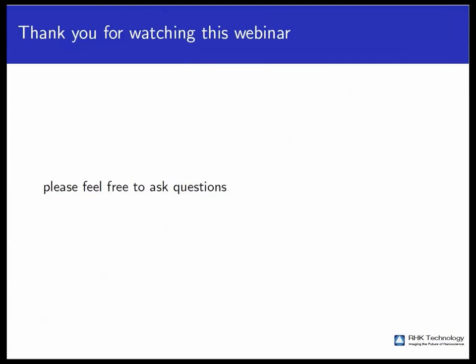It looks like we have one more question right now. Can the R9 PLL be used with Colibri sensors? Colibri sensors, as far as I know, have quite high resonance frequency. I'm not exactly in the picture, but we can drive Colibri sensors with resonances up to 15, 17 megahertz.